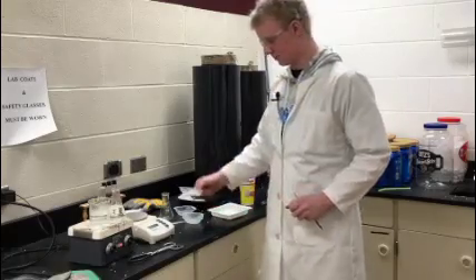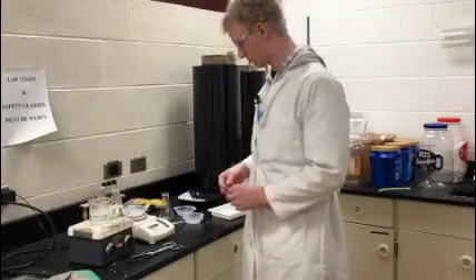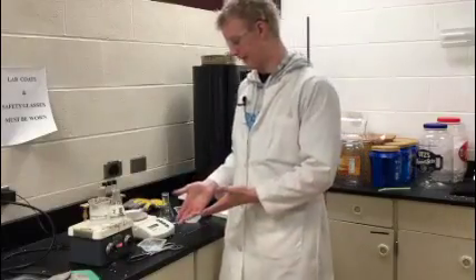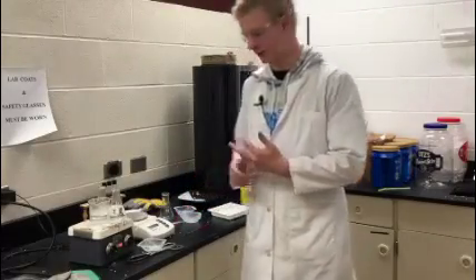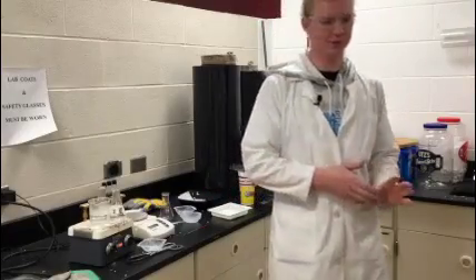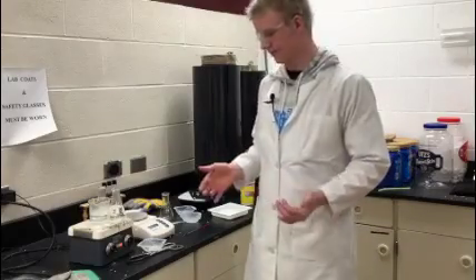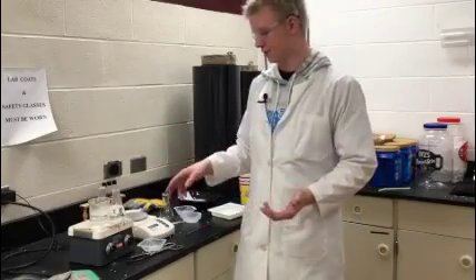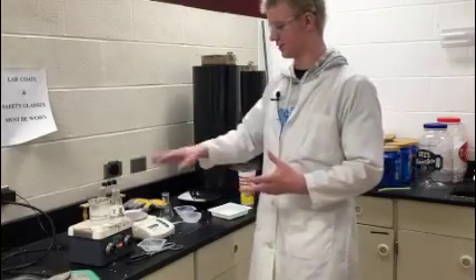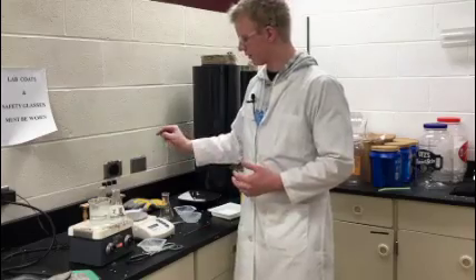Now we are going to mass them, and you are going to want to record this data. After you've recorded the mass, you are going to put it in the oven for 24 hours. Then you are going to repeat those steps for the two other boiling water samples, and repeat it tomorrow for the room temperature ones.